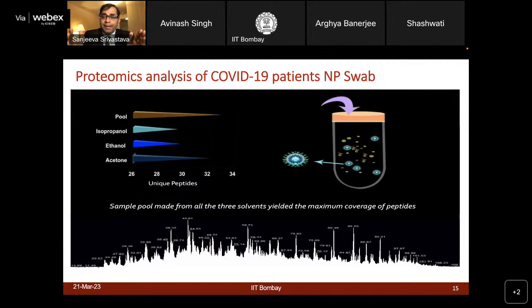So I hope you are now able to connect that first you have to prepare the samples, which requires protein quantification and peptide quantification. You then need to make a lot of settings changes in the LC and MS parameters. Then you can use different instrumentation like the Orbitrap Fusion, which we showed today, for separating your complex peptides. At the end of all that complex work, you get these peptide spectra, which you need to search further to identify which organism these proteins are coming from, and what kind of protein and peptide sequences we have.